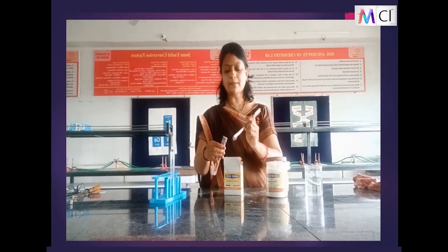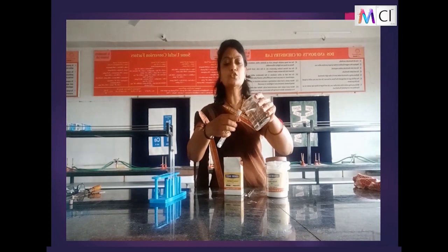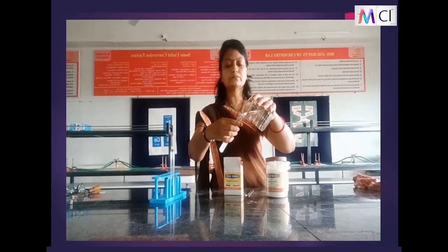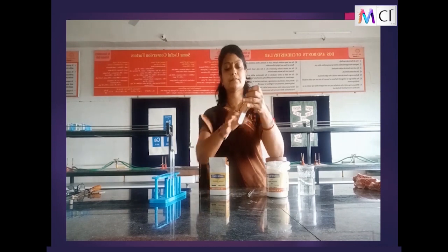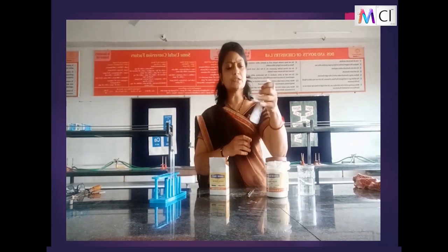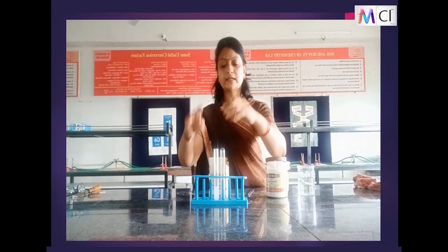So a small sample of sodium sulfate, and we'll make a solution of it. So I will add water to it and just shake it very well. It gets very easily dissolved in the water. So I have the sodium sulfate solution ready over here. So I'll keep it here.